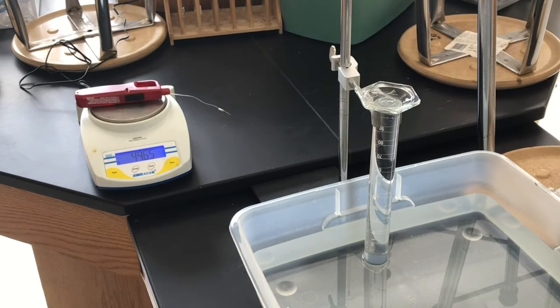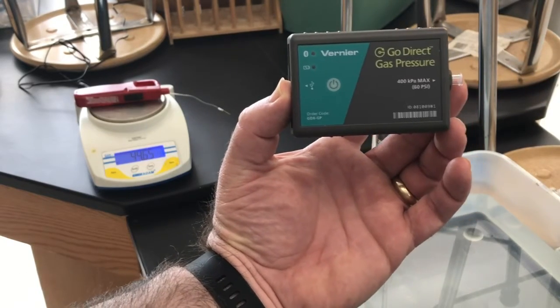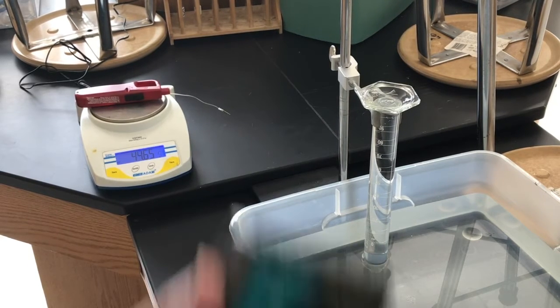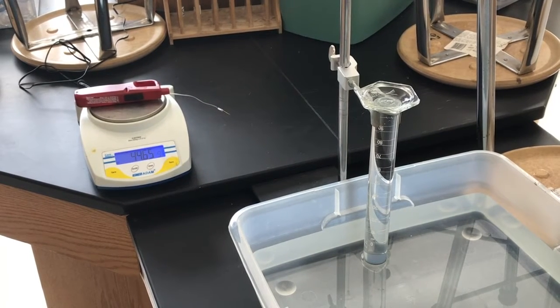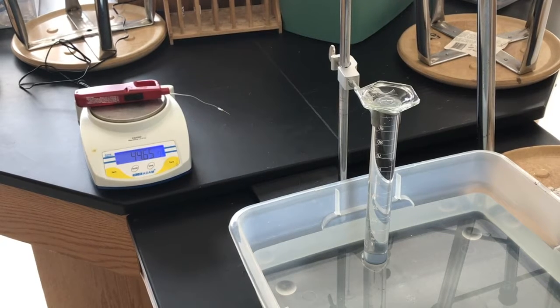Now I'm going to measure the atmospheric pressure using a little gas pressure sensor. There it is on the camera. I measured that and it came out to 98.8 kilopascals, I believe. I have a screenshot of that I'll attach as well. You can also do this before the days of pressure sensors, or if you didn't have one of these, you could look it up on weather.com or something like that, and they always give the atmospheric pressure, but that's for your local area. So hopefully our reading that we're getting with our sensor here is for this room under these conditions right now.